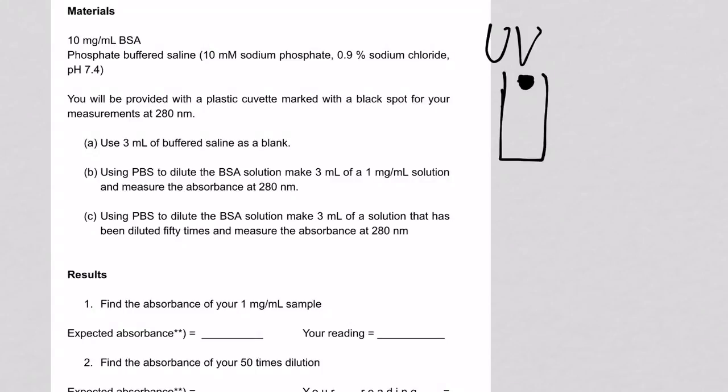It's a little bit like with glass. Normal window glass will not allow UV light to go through. So that's why you can't get a sunburn or suntan inside, even if the sun is going through the normal window. UV light will be blocked out. And in this case, we need this kind of cuvette because if the UV light is blocked out, then the whole experiment is basically pointless.